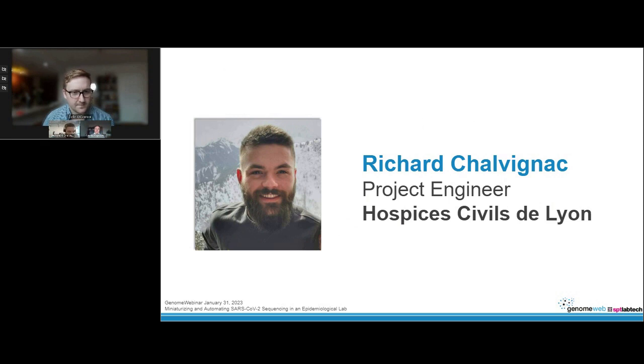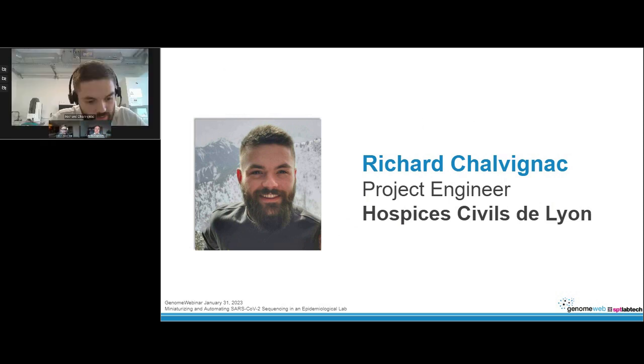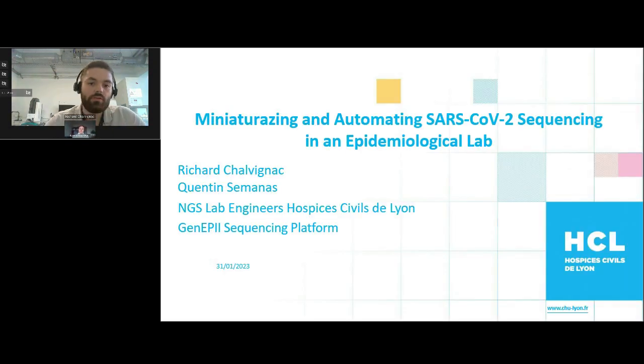Thank you, Colin. Hi, everyone. Thanks for introducing us. So, as Colin said, we are going to make a presentation on miniaturizing and automating SARS-CoV-2 sequencing in an epidemiological lab. So I'm Richard, and I'm with my colleague Quentin. We are both NGS lab engineers at the Lyon Civil Hospital, and we are part of the GenEpi sequencing platform.